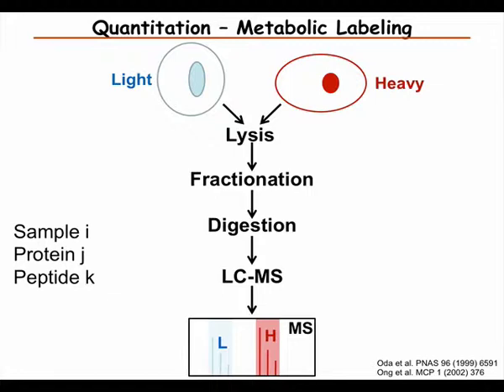How much exposure until they get sick? So what you try to do is to have 100% labeling. That's not always achieved. You have a distribution, and maybe some proteins are only 90% or 95%, but it's a lot, because otherwise it's very difficult to do the experiment.